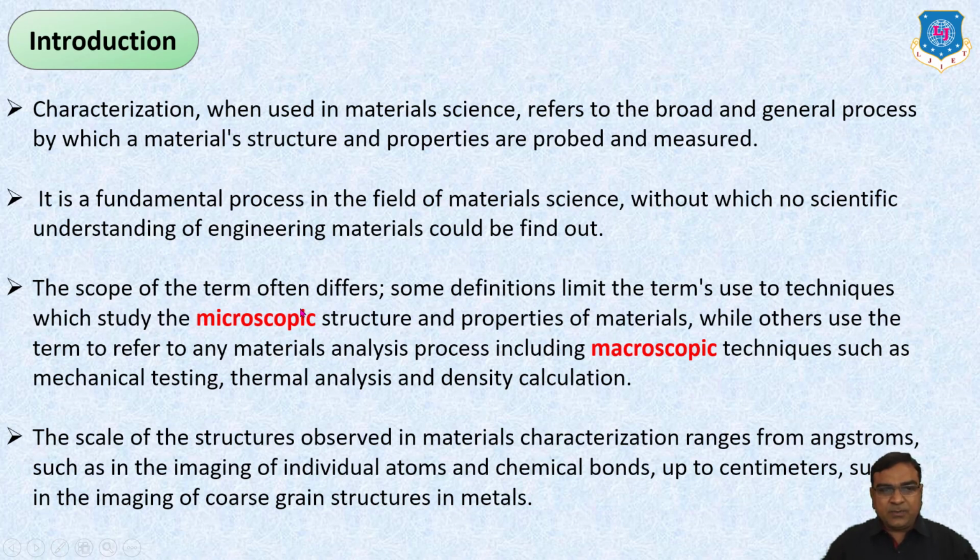The scope of the term often differs. Some definitions limit the term to techniques which study the microscopic structure and properties of materials, while others use the term to refer to any material analysis process, including macroscopic techniques such as mechanical testing, thermal analysis, and density calculation.